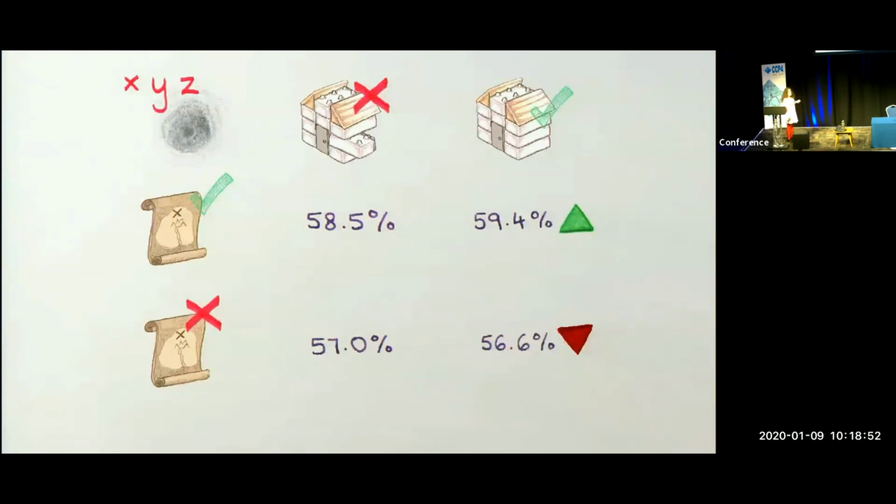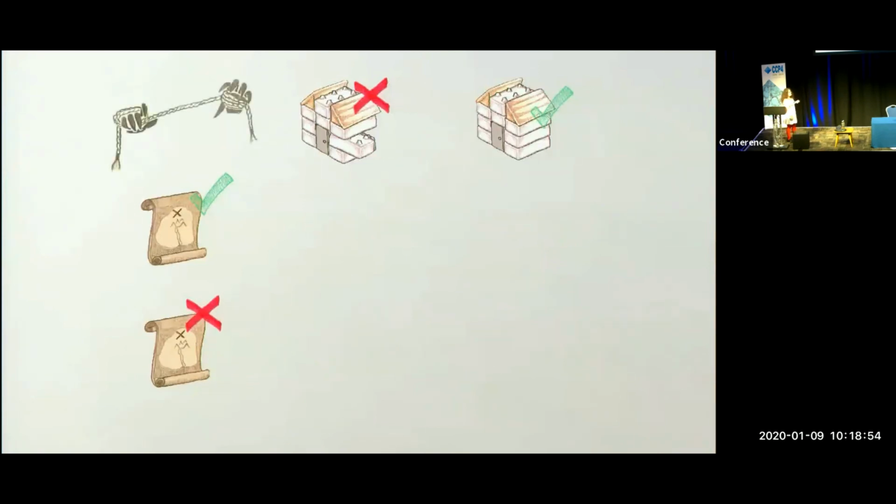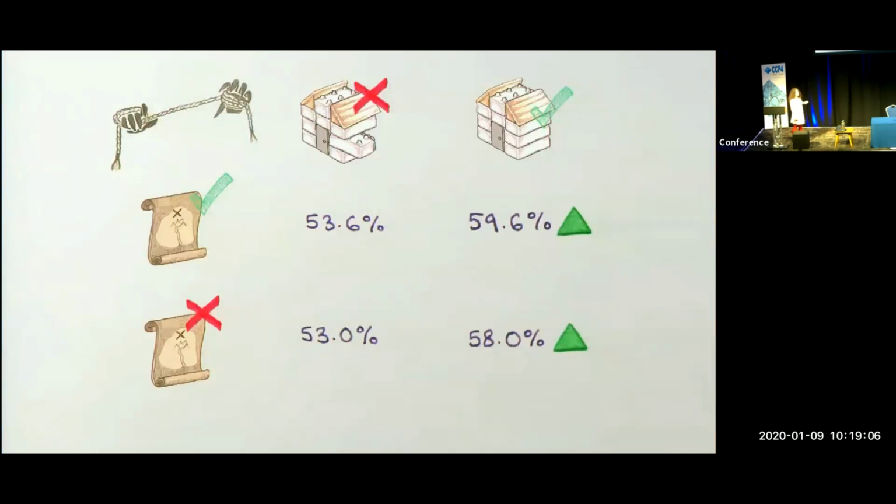So the results for the Vagabond refinement are not the same. In both cases, the correlation coefficient increases regardless of which map you've used to refine the model against.